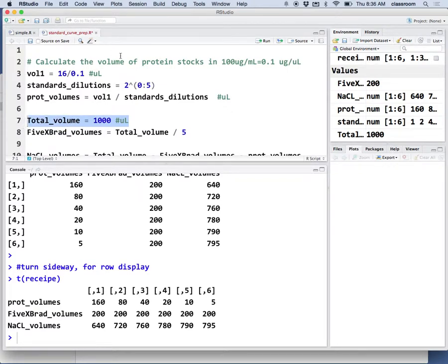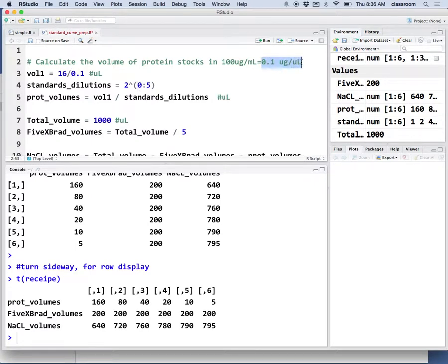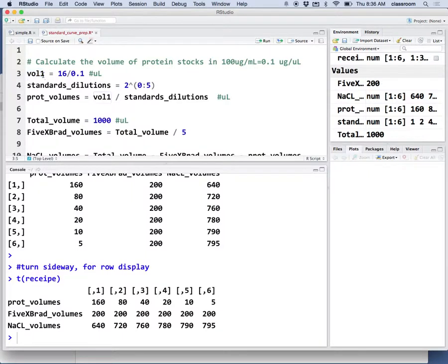The protein stock is 100 micrograms per milliliter, which is 0.1 micrograms per microliter. That's the protein concentration. Let's first calculate the first tube, volume 1.